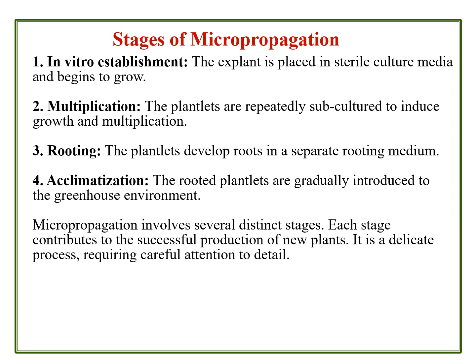In the next stage, that is rooting, this is after evaluating the complete multiple shoots or adventitious shoots, because the cytokinin to auxin rich ratio enhances the multiplication of multiple shoots from the lateral or apical stages of the cell aggregates or callus aggregates. Then they are induced to enhance the rooting at the base, that is at the radicle stage.